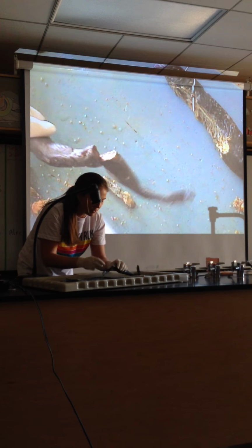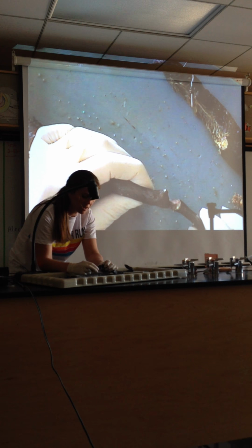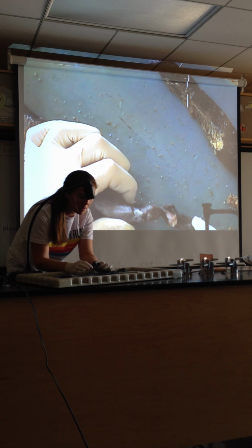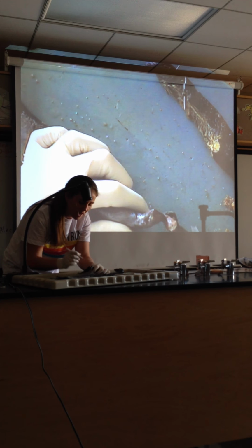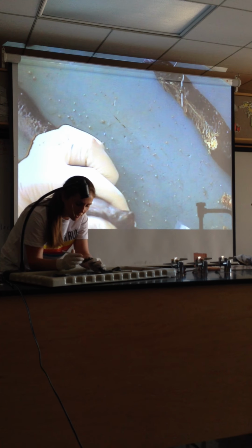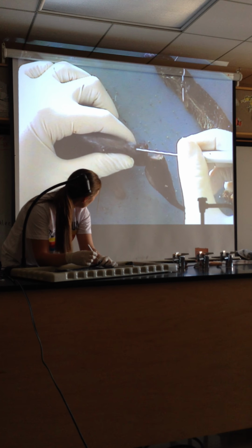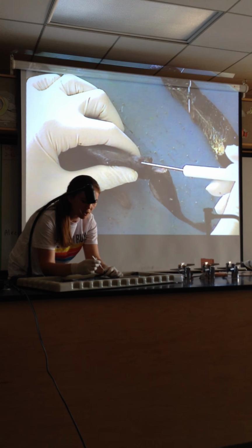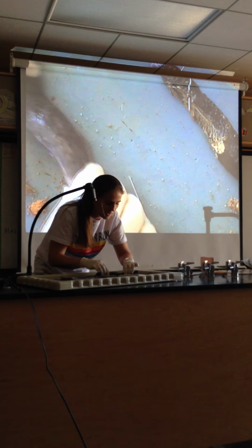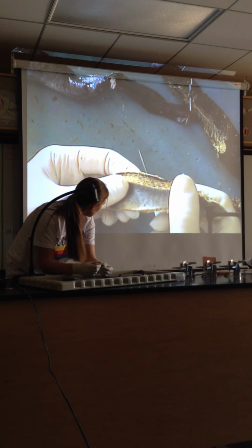All right, the next thing you're going to have to look at is, of course, the cloaca, which is the cloacal and anal opening. If you go back to the tail or posterior region of the organism where they have the cut itself, and you just go anterior to the cross-section that they've created, you're going to find a hole. That hole is going to be the cloacal opening, and the cloaca and anus are in this area.